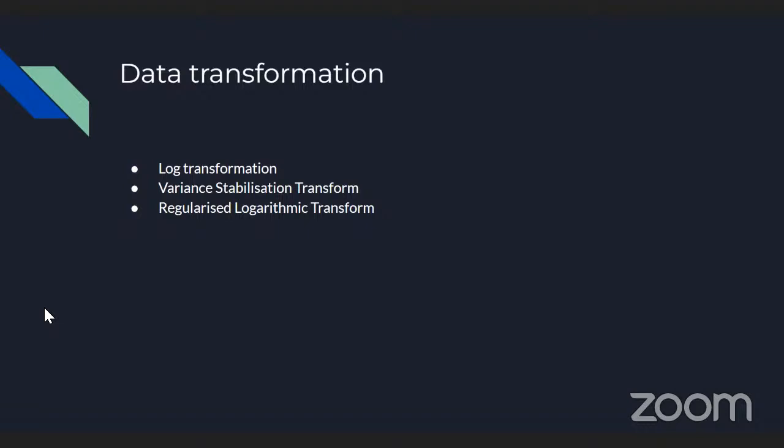Yeah, so there are these two other packages. pheatmap is to create heat maps, and RColorBrewer is a library for colors actually. So yeah, I'm giving the directory where I have saved my files, and then I'm reading the count data that you get after aligning to a genome with any aligner.